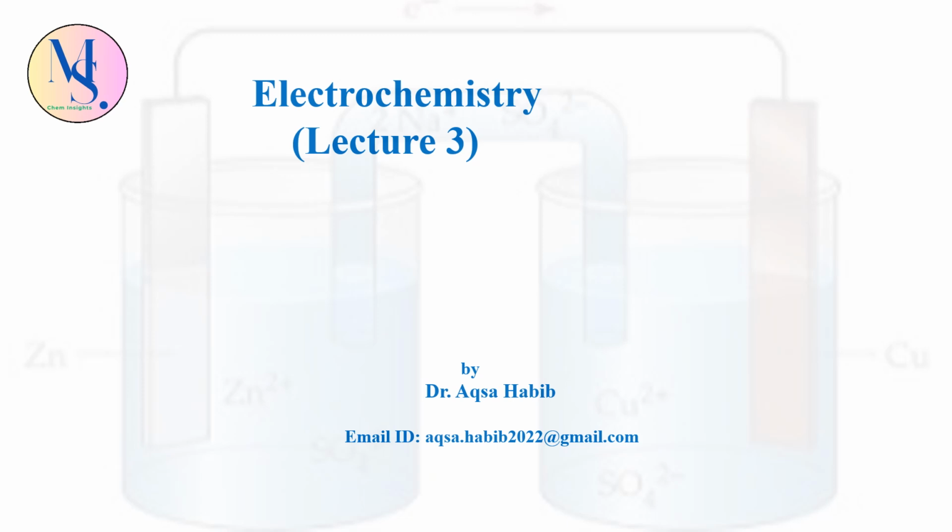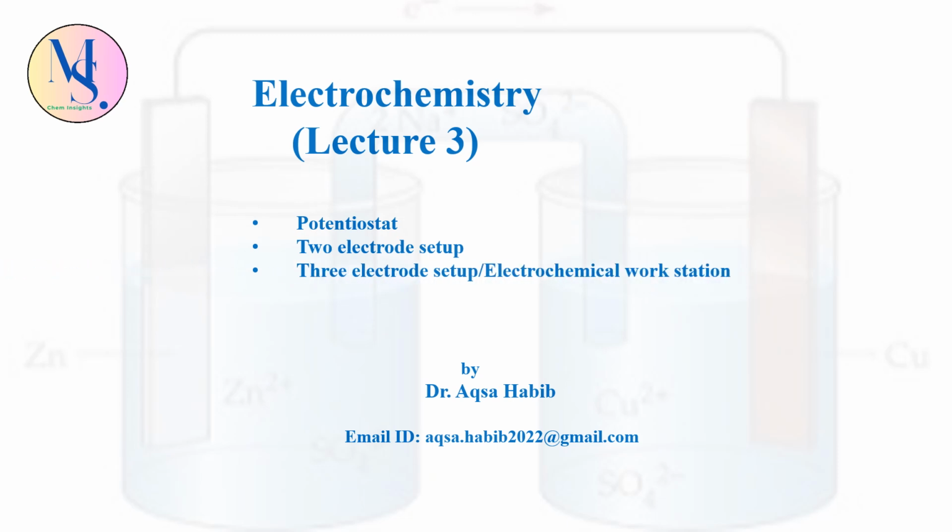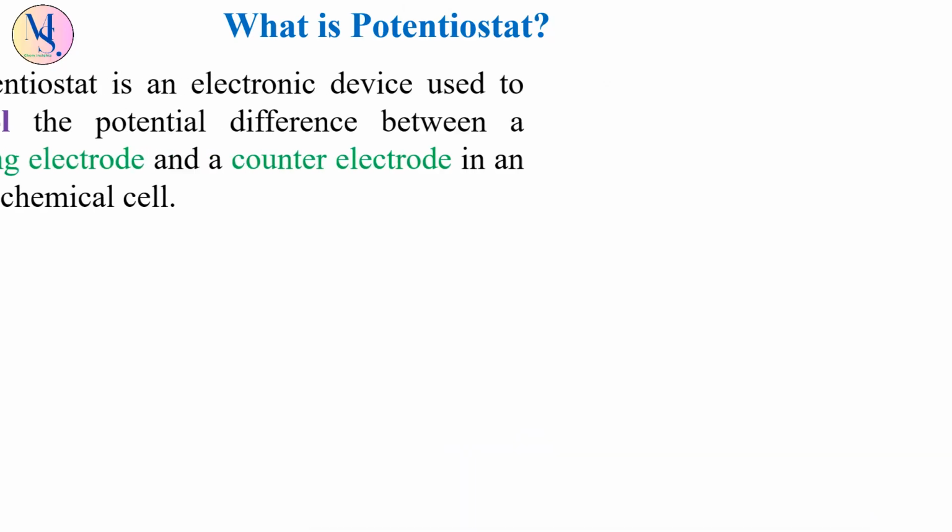Today I am going to discuss the third lecture of electrochemistry. Its contents are potentiostat, two electrode setup and three electrode setup, which is actually called electrochemical workstation. So let's start with potentiostat.